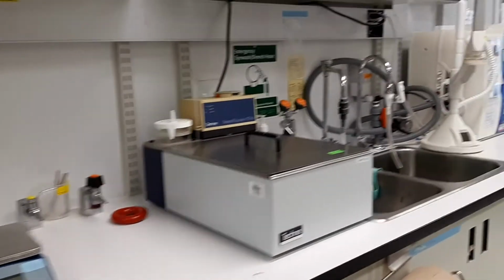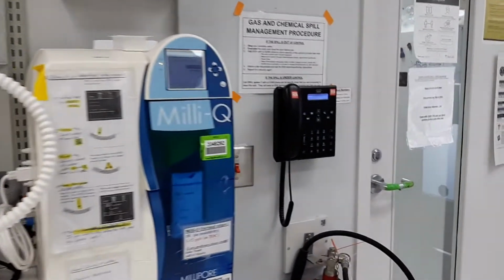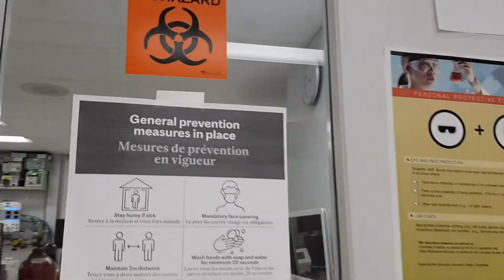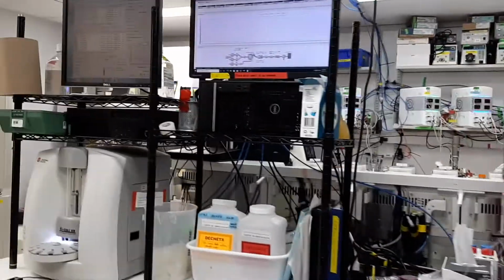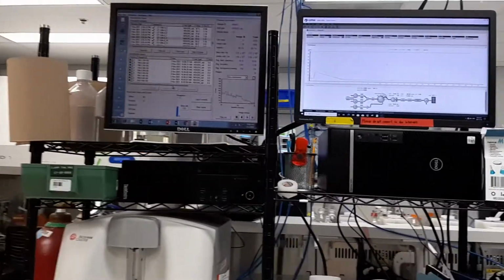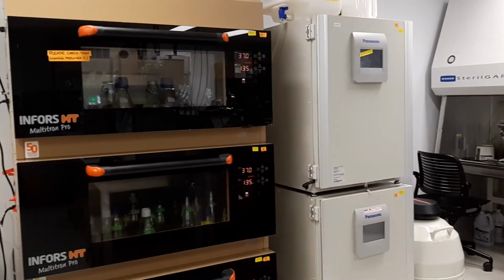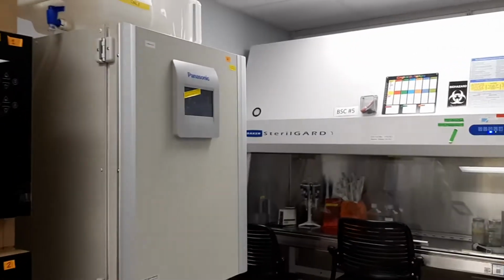The expression platforms are centered around eukaryotic cell-based systems in suspension, namely HEK293, Vero, and insect-derived cell lines. The viruses we are currently working with in biosafety level 2+ laboratories include recombinant adeno-associated virus, AAV, adenovirus, lentivirus, vesicular stomatitis virus, VSV, Newcastle disease virus, NDV, and influenza virus.